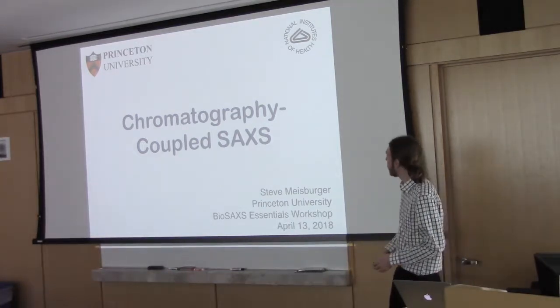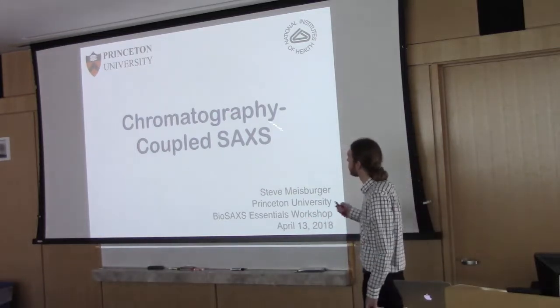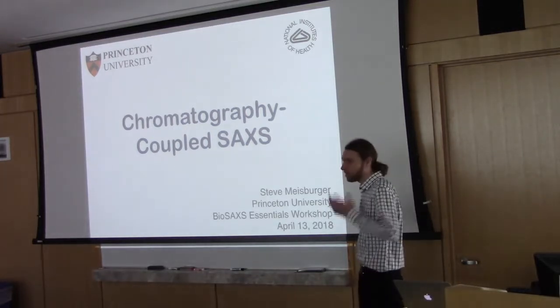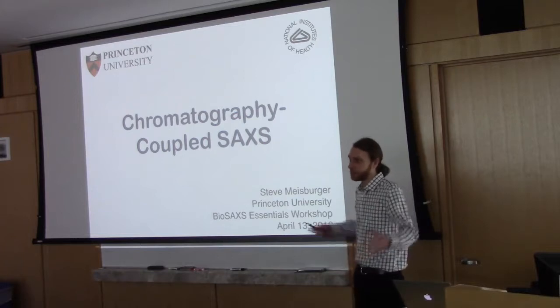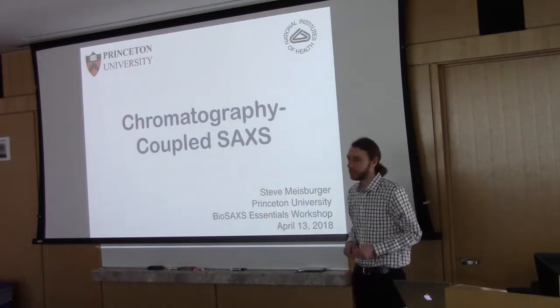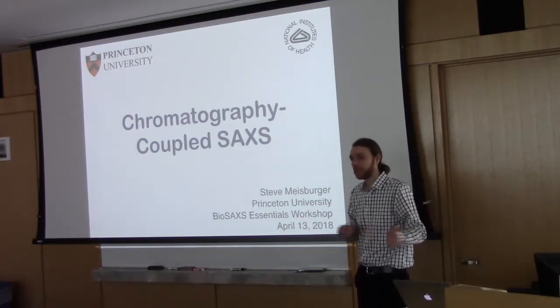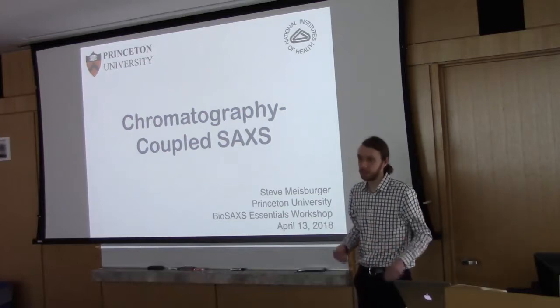So this talk will be broadly about chromatography-coupled SAXS, and I'm also going to bring in an example from my own research that brings together a lot of different techniques to study protein allostery. So you'll get an idea of how different ways of collecting SAXS data can work together to support a model for a story.